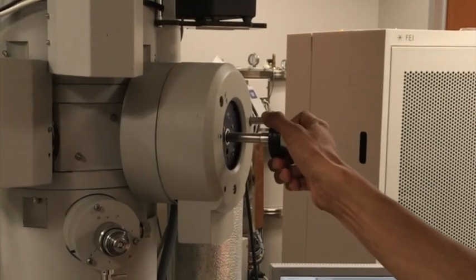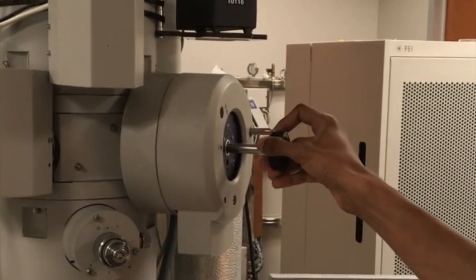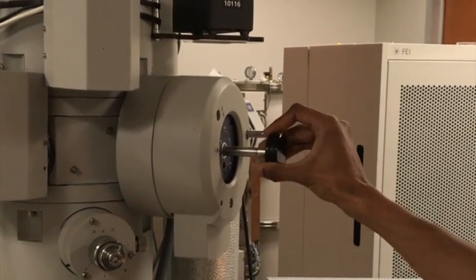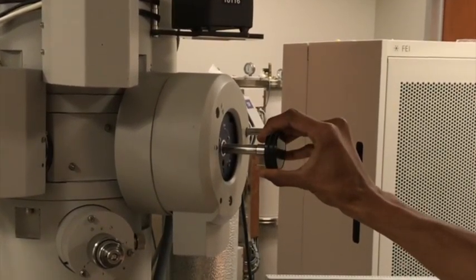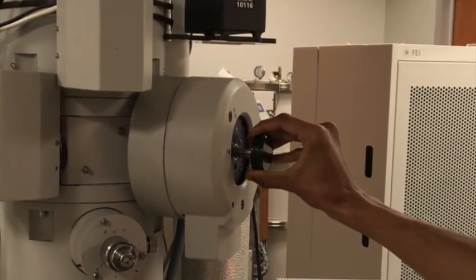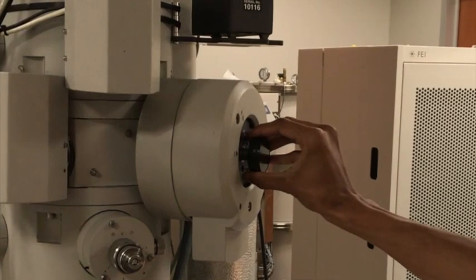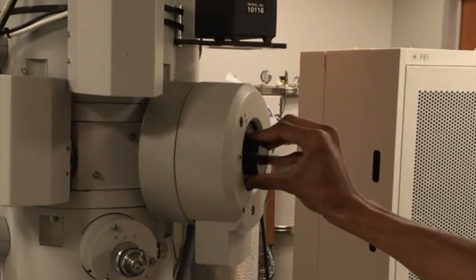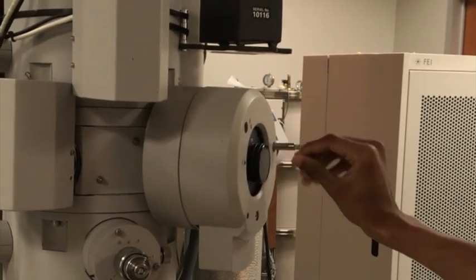You can turn the holder now in the counterclockwise direction, and once it's in the right position, you will feel a suction pulling the holder into the column. You try to resist this force to make sure the loading process is as smooth as possible.